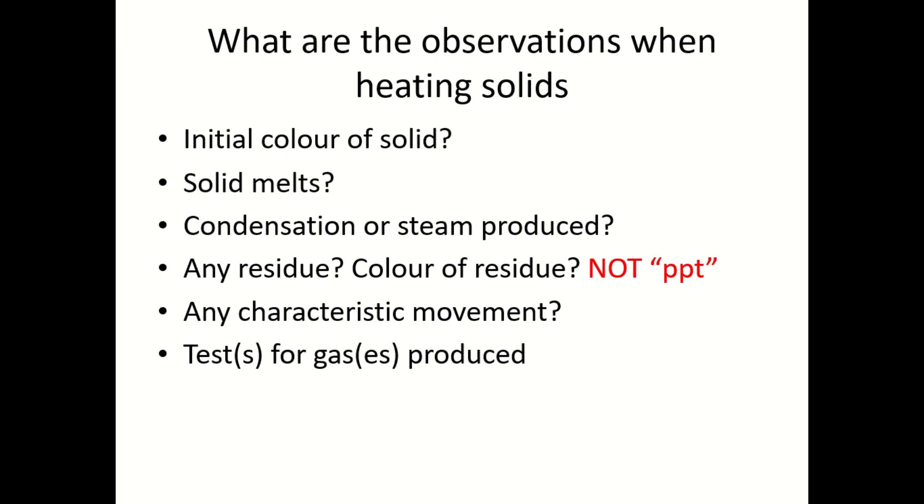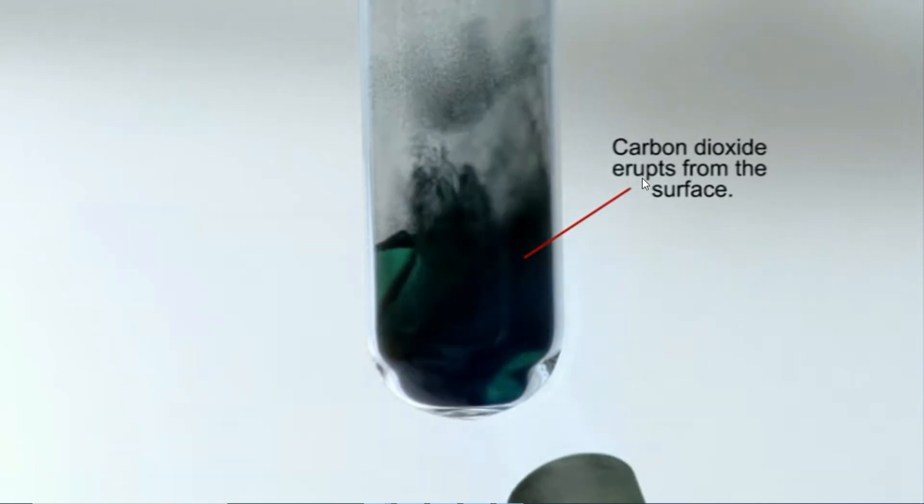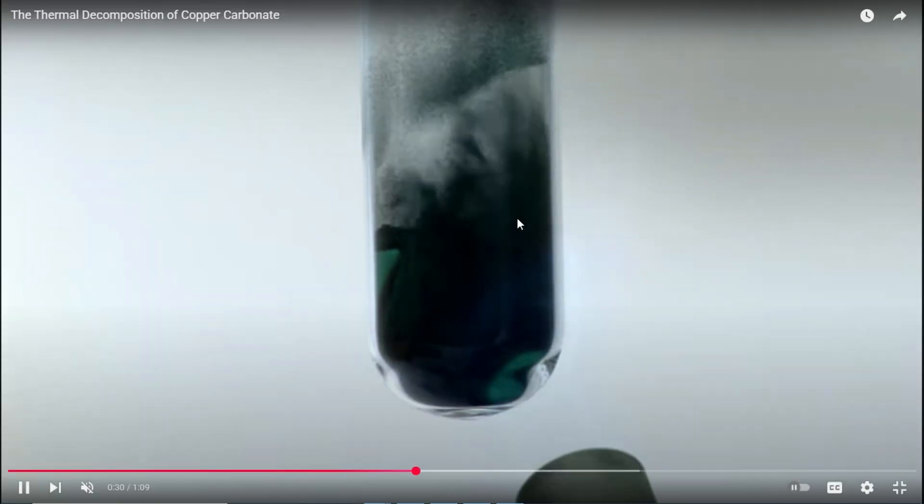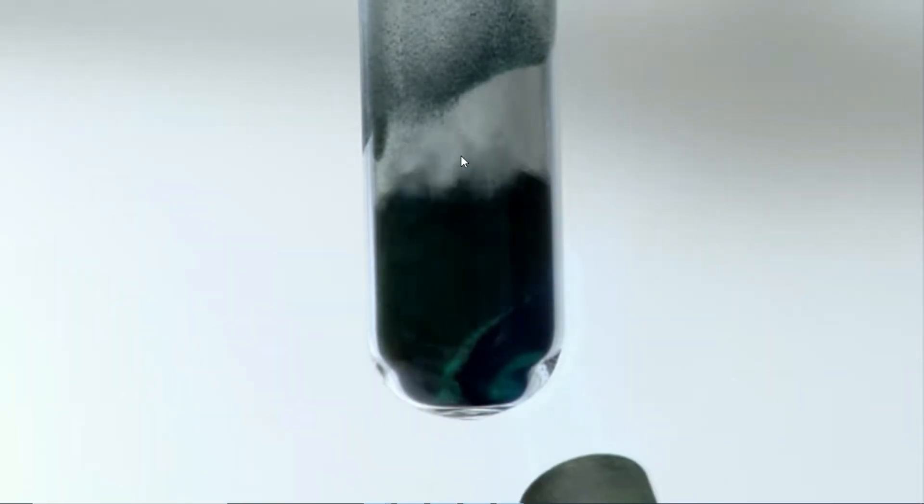Let's look at the second last question: any characteristic movement? Some solids will jump upon heating, for example copper carbonate. This is the same video that we were watching just now. Copper carbonate upon heating, the solid will jump around in the test tube. This is a very characteristic movement for heating copper carbonate, so please write down as one of your observations.